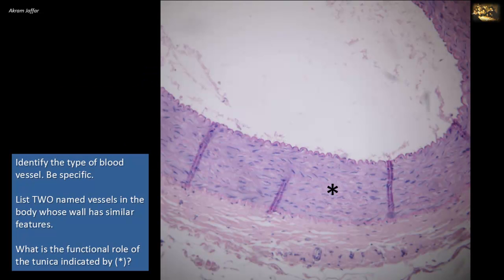Identify the type of blood vessel, be specific. List two named vessels in the body whose wall has similar features. What is the functional role of the tunica indicated by the star?